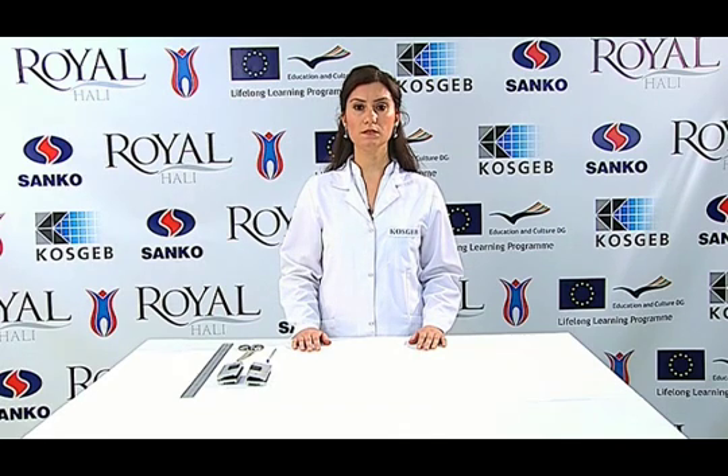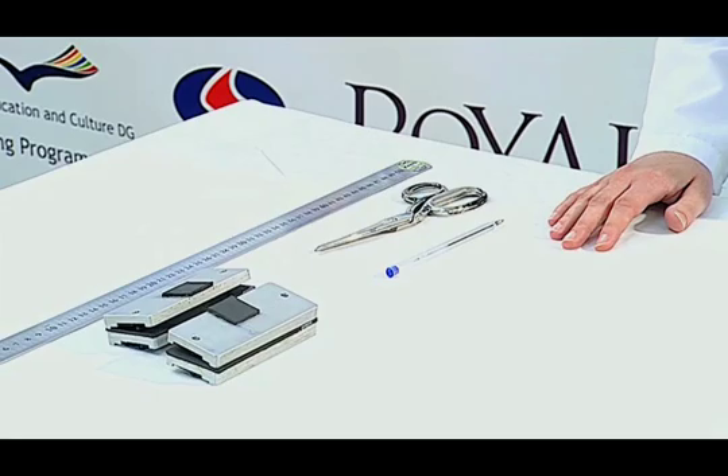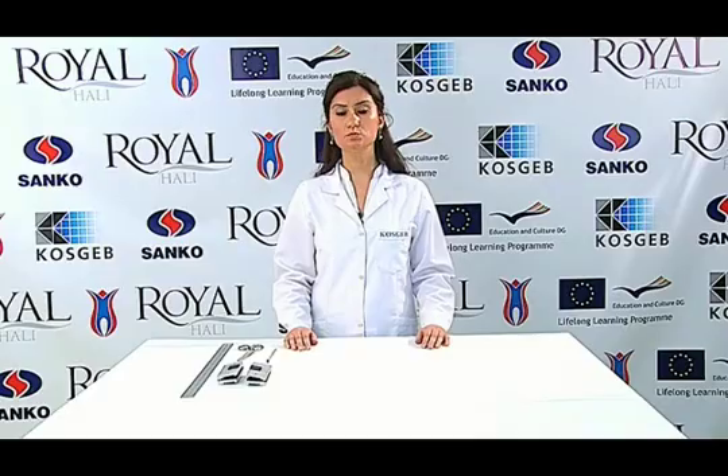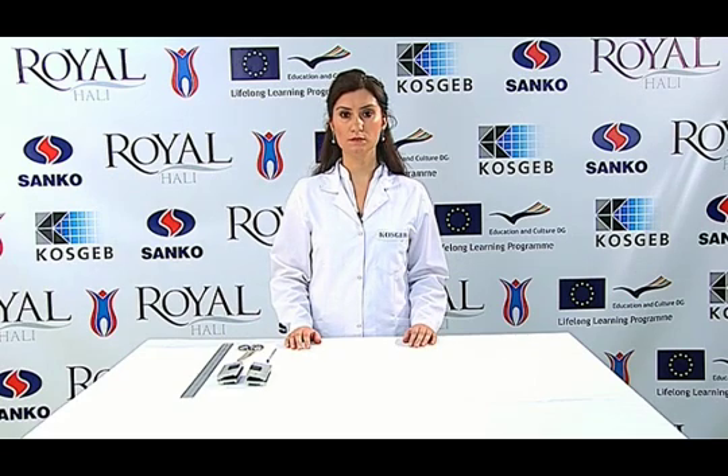In this test, we use the universal testing machine, a sewing machine, a 90-number metric sewing needle, 100% polyester thread, scissors, a ruler, and appropriate jaws. First of all, test samples are conditioned under standard atmospheric conditions for 24 hours.